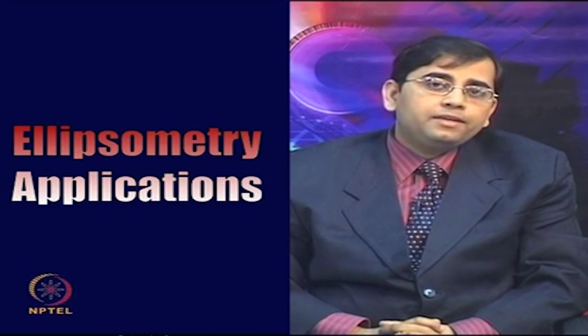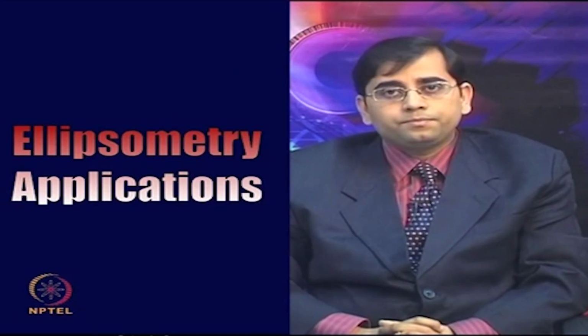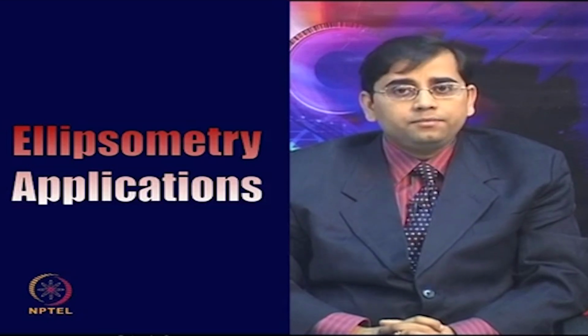Now, let us discuss a few of the ellipsometry based applications. Ellipsometry has been successfully applied for many applications such as biomolecular interactions, hormonal activity, cell factor and its receptor binding, diagnosis for hepatitis B, kinetic measurements of multi-protein interaction processes, and quantification of competitive adsorption of protein. The combination of imaging ellipsometry with a microfluidic system can provide many advantages which are not possible to obtain from these individual instruments. This configuration, the combined imaging ellipsometry and microfluidics, was applied for real time measurement of binding kinetics of SARS virus.